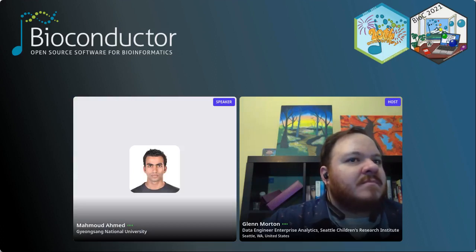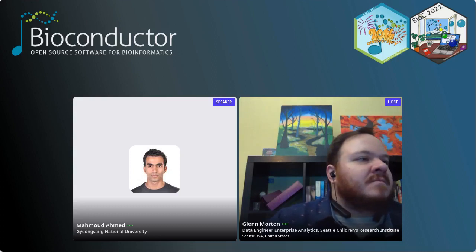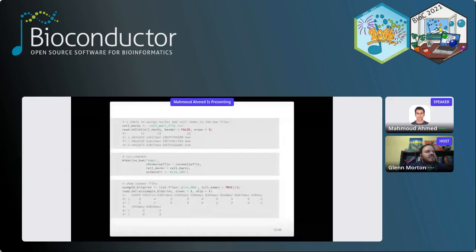Yeah, I also lowered the resolution. Okay. Yeah, if you can go ahead and share your screen, let's see if we can do that. That looks good.